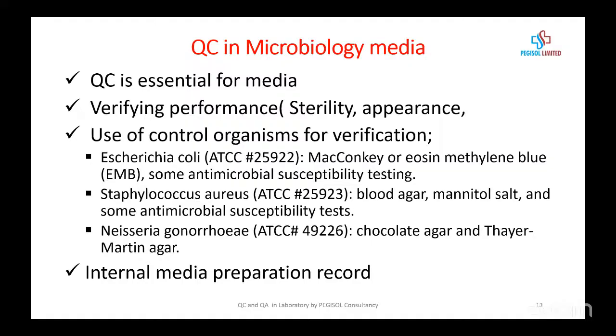These are various control organisms you can use for verification. You can use Staph aureus for blood agar, mannitol salt, and some antimicrobial sensitivity testing. You can use Neisseria gonorrhoeae ATCC for chocolate agar and Thayer-Martin agar. You can use Escherichia coli for MacConkey agar, or EMB, and some antimicrobial sensitivity testing.